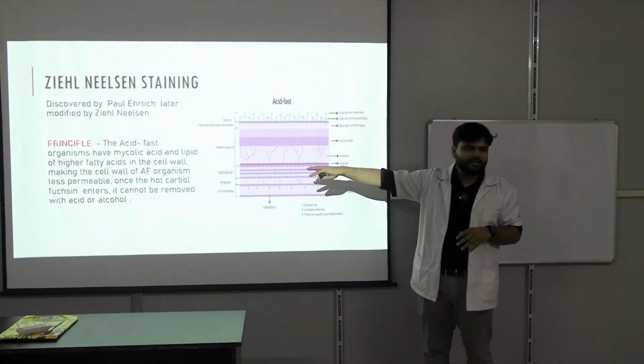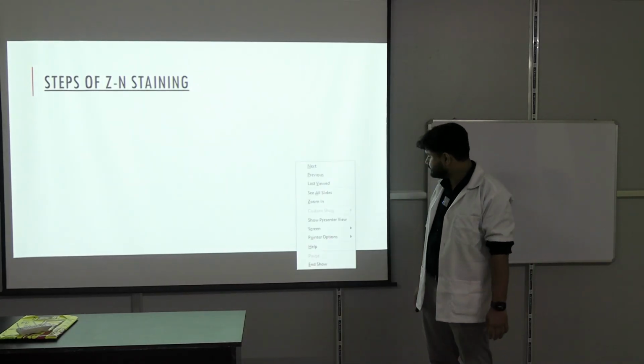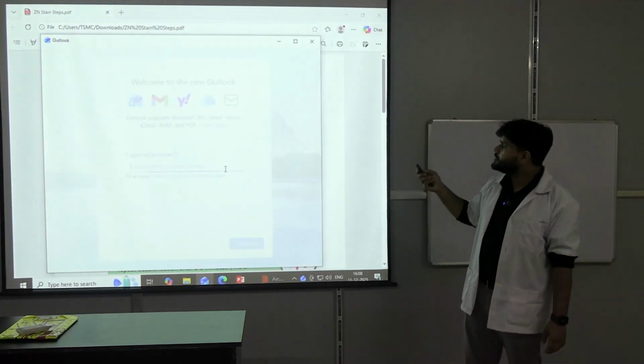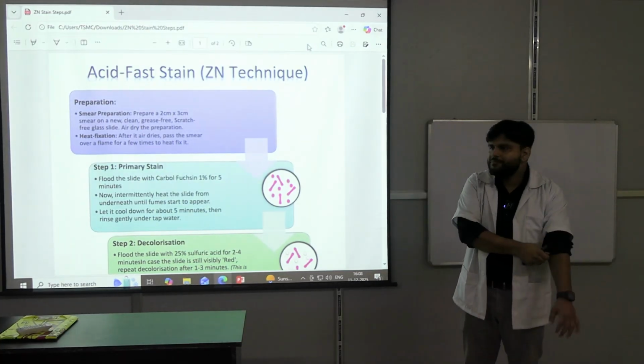You can read in details in your books also, okay? So we'll go to the steps of the Zn stain. Just wait for a moment. So the first step is always a preparation, okay? Preparation, you guys already know how to prepare a smear, but I don't think you have this in your curriculum.